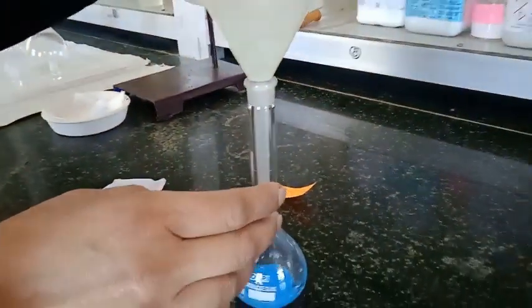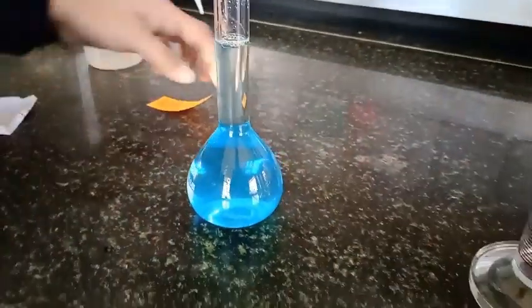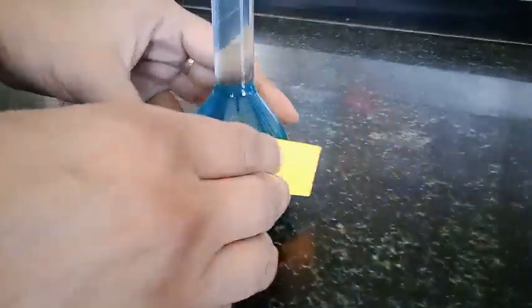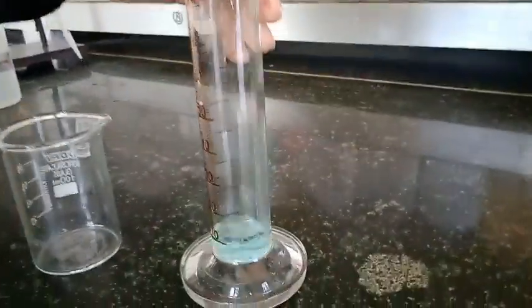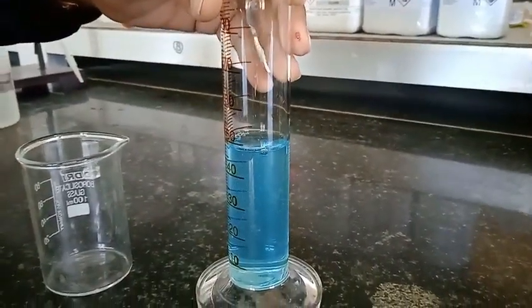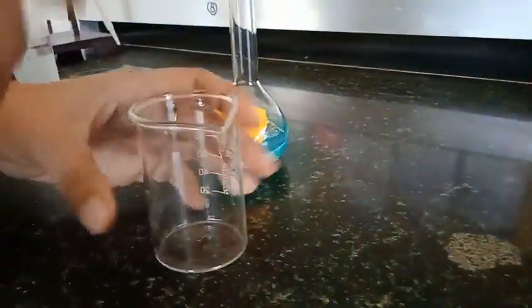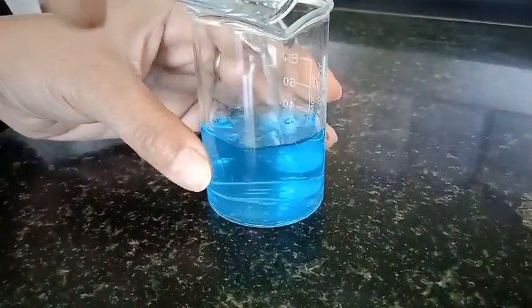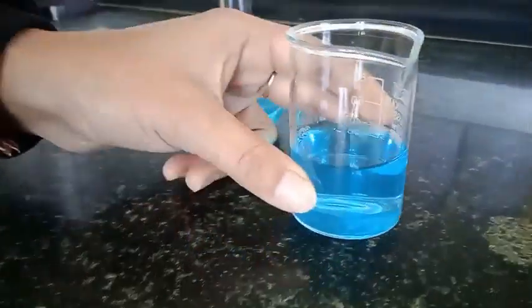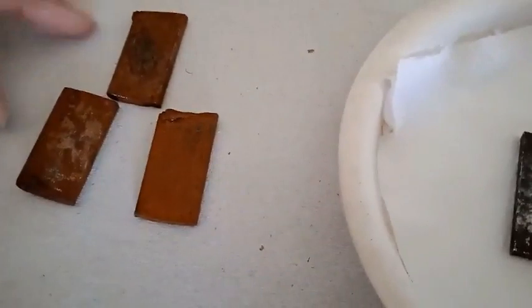Now after dissolving it, make up the solution up to the mark. So this is M/10 copper sulfate solution. Before using it, I shake it well. Now after shaking it thoroughly, I am just transferring 50 ml of this copper sulfate solution in the measuring cylinder, and this 50 ml I am going to transfer in the beaker, and in this beaker I am going to transfer these strips of iron.